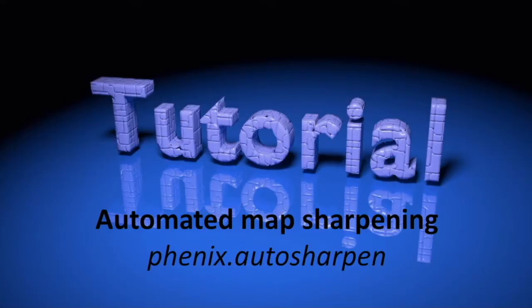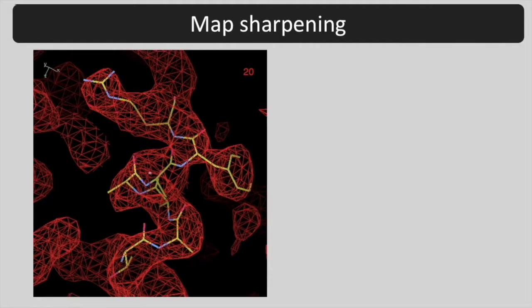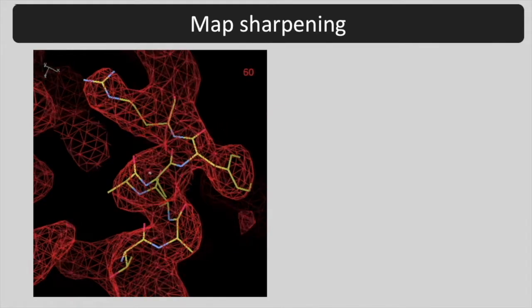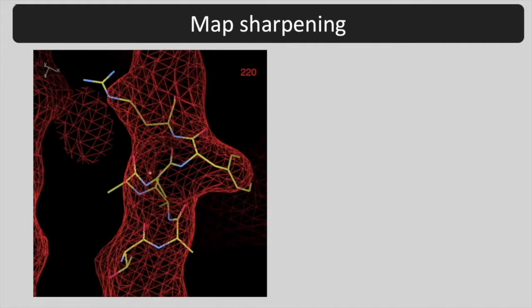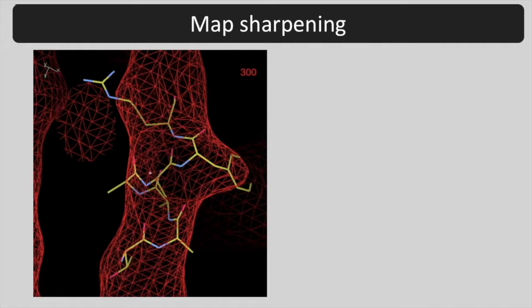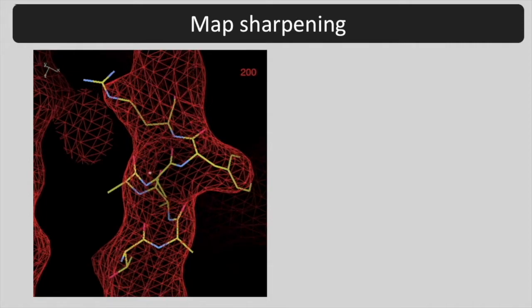Today we're going to learn about automatic map sharpening using AutoSharpen in the Phenix GUI. Have a look at this CryoEM map. We are going to blur and sharpen this map by adjusting the resolution dependent weighting of the map.